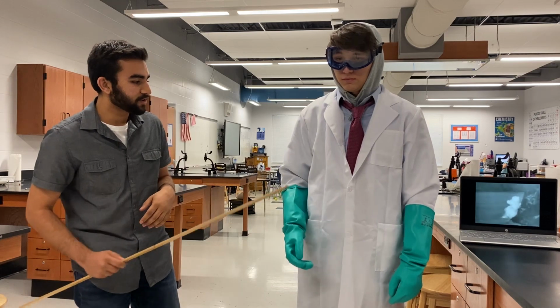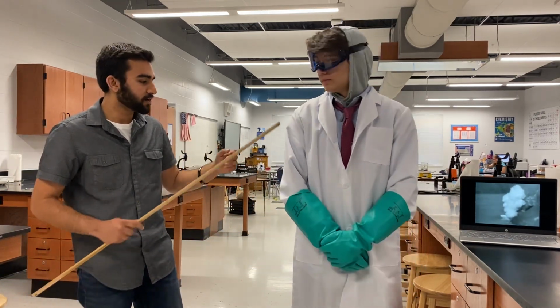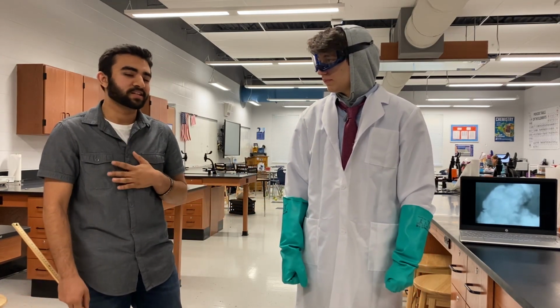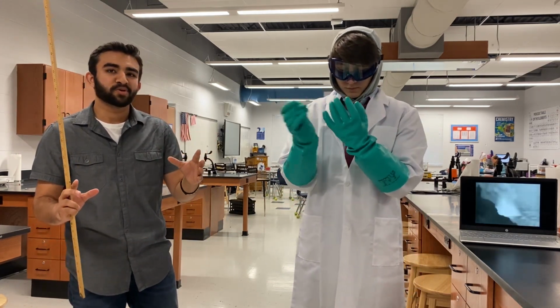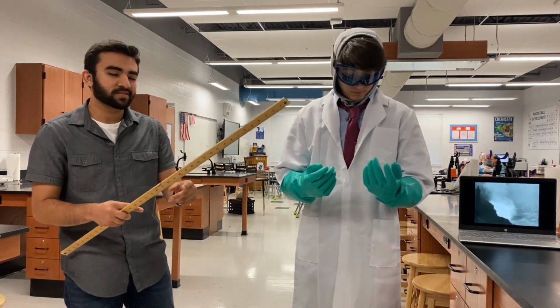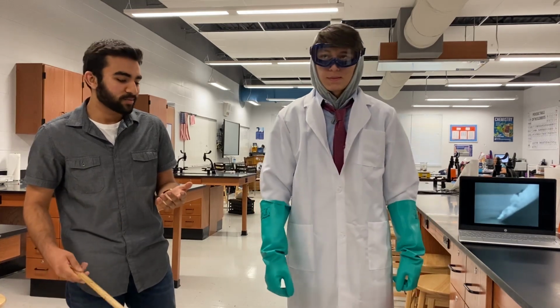Next, you have the lab coat that is present across his body. It's a good cover for his arms, his chest. It'll help him out if he was to spill anything on himself. Next, he has the gloves. Hands are the component that you would be using most often in the lab situation, so that would be the most likely area to actually get afflicted by any damage.